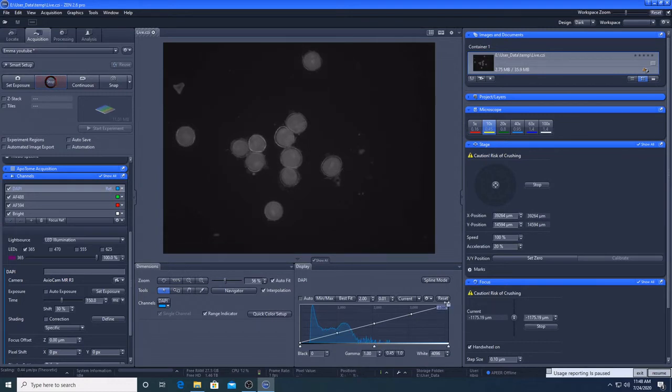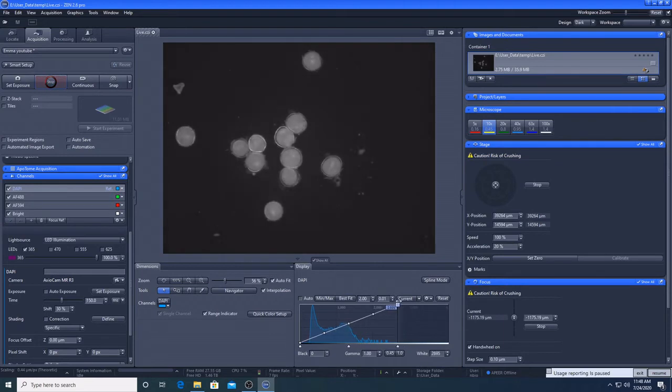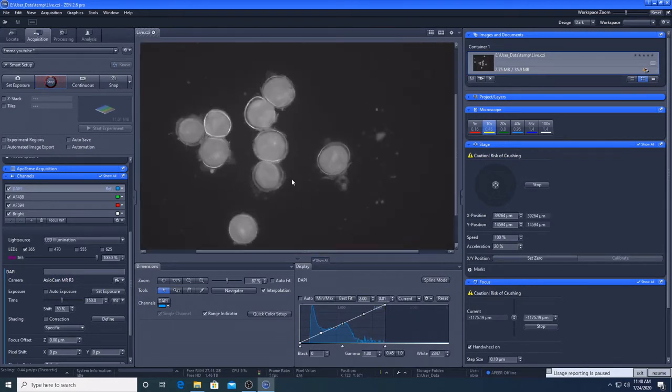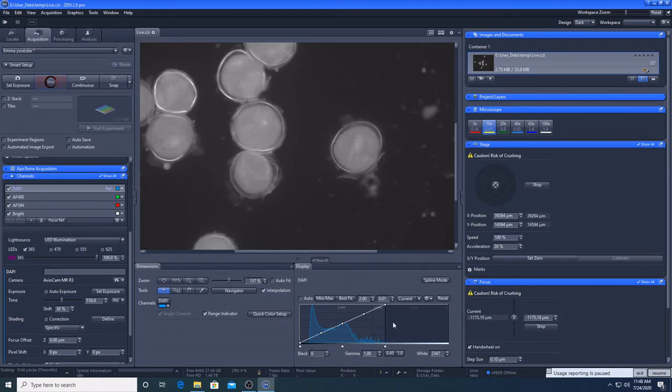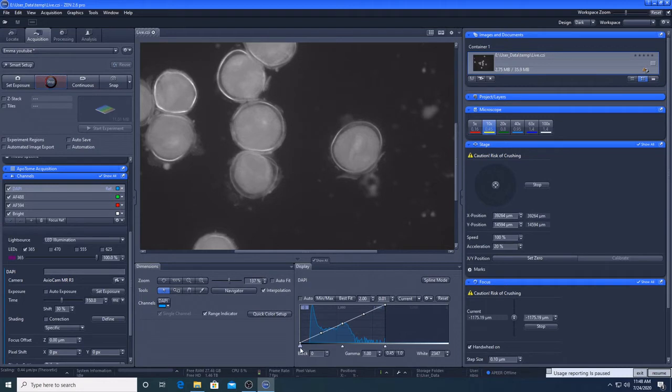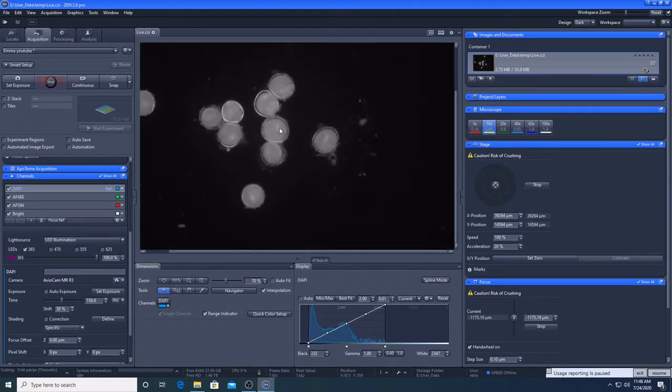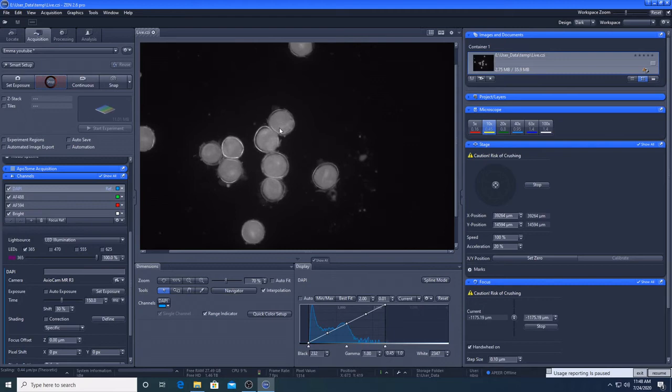If you want to increase contrast to aid visualisation without increasing light intensity or exposure time, you can change the way the image is displayed. To do this, adjust the minimum and maximum range of the histogram. This will not alter the data you are capturing. You can also use the mouse to digitally zoom in and out. I am happy with these settings for the DAPI channel, so I will adjust the settings for the other fluorescent channels in the same way.